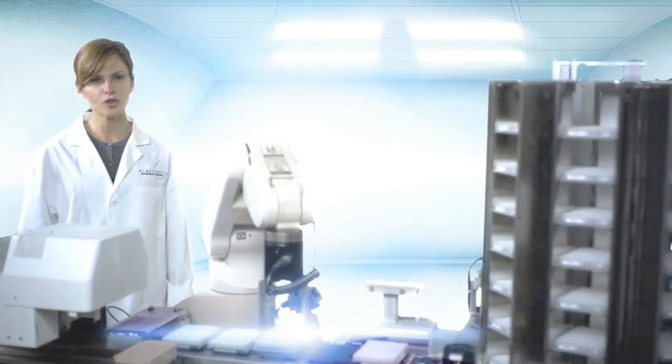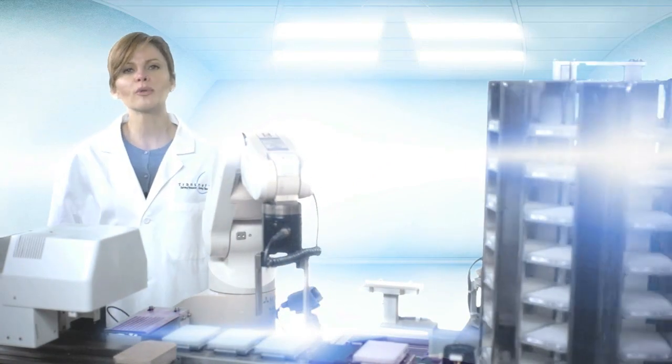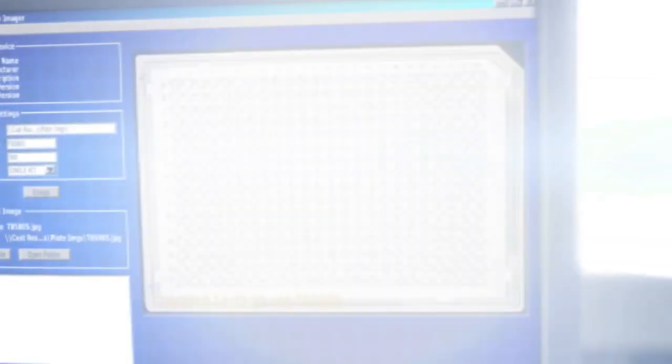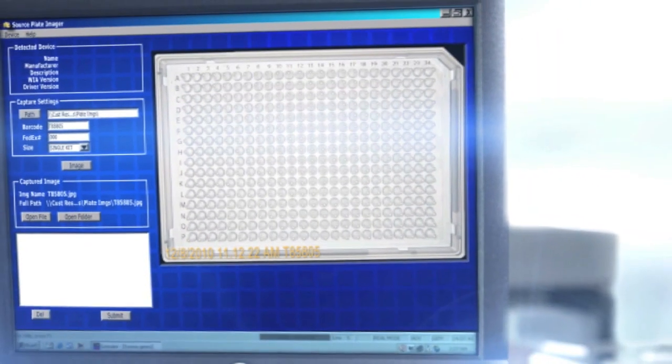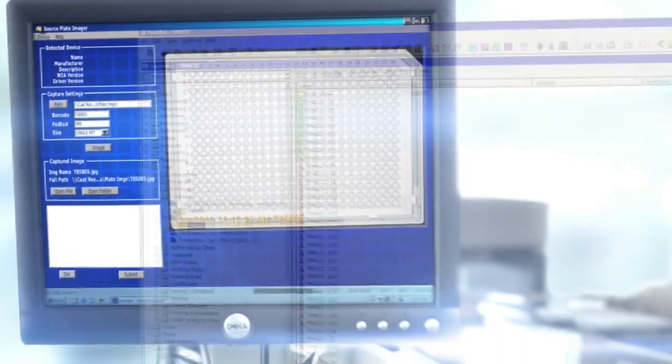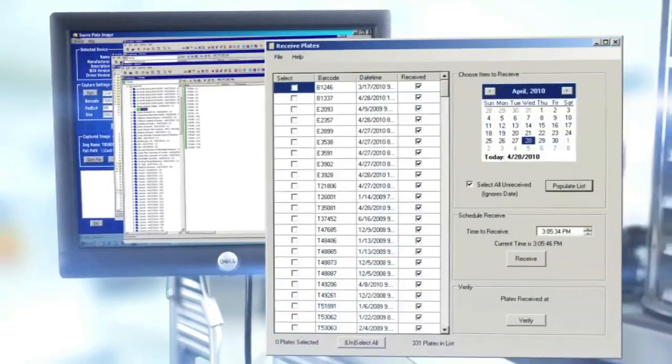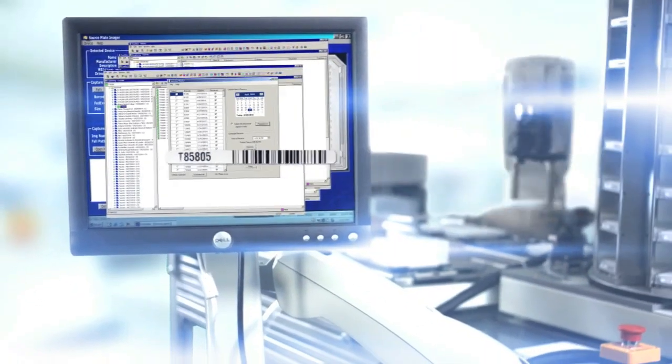Once your sample arrives at the Transnetics facility, the process begins. Your well plate barcode is scanned into the system, which creates a worklist for the robotic, fully automated genotyping service. Our customized LIMS system tracks every sample with redundancy throughout the process using barcodes and a complete chain of custody.